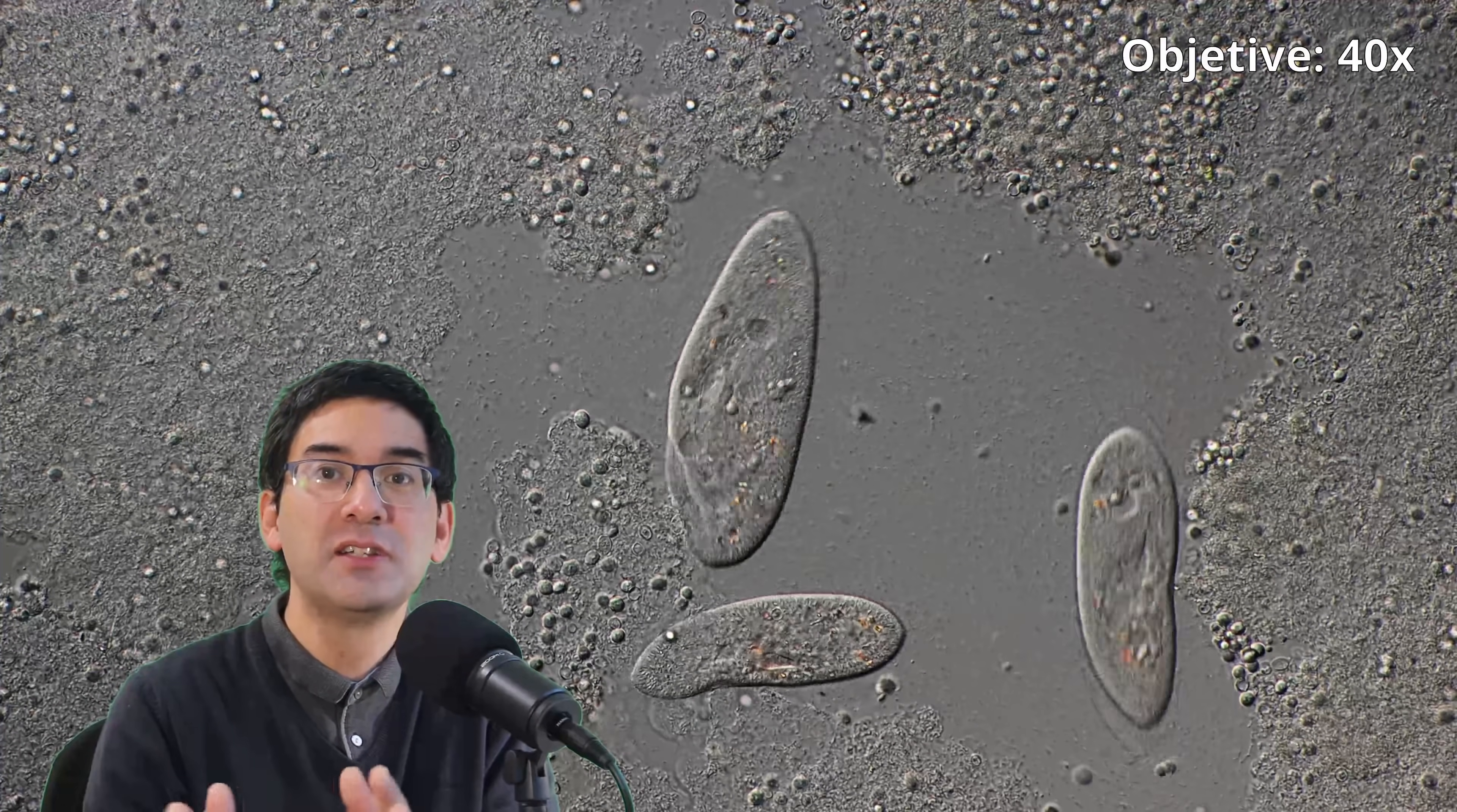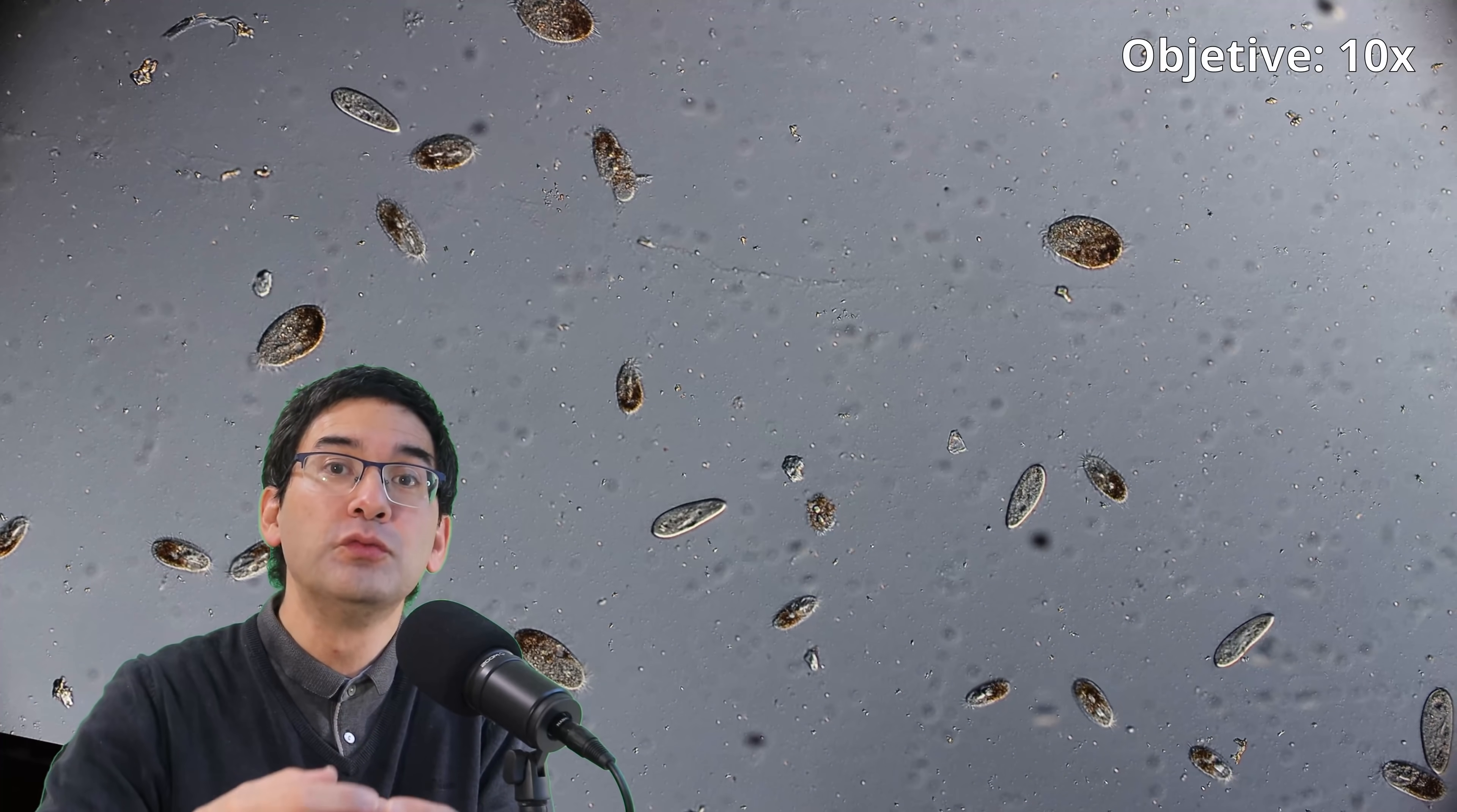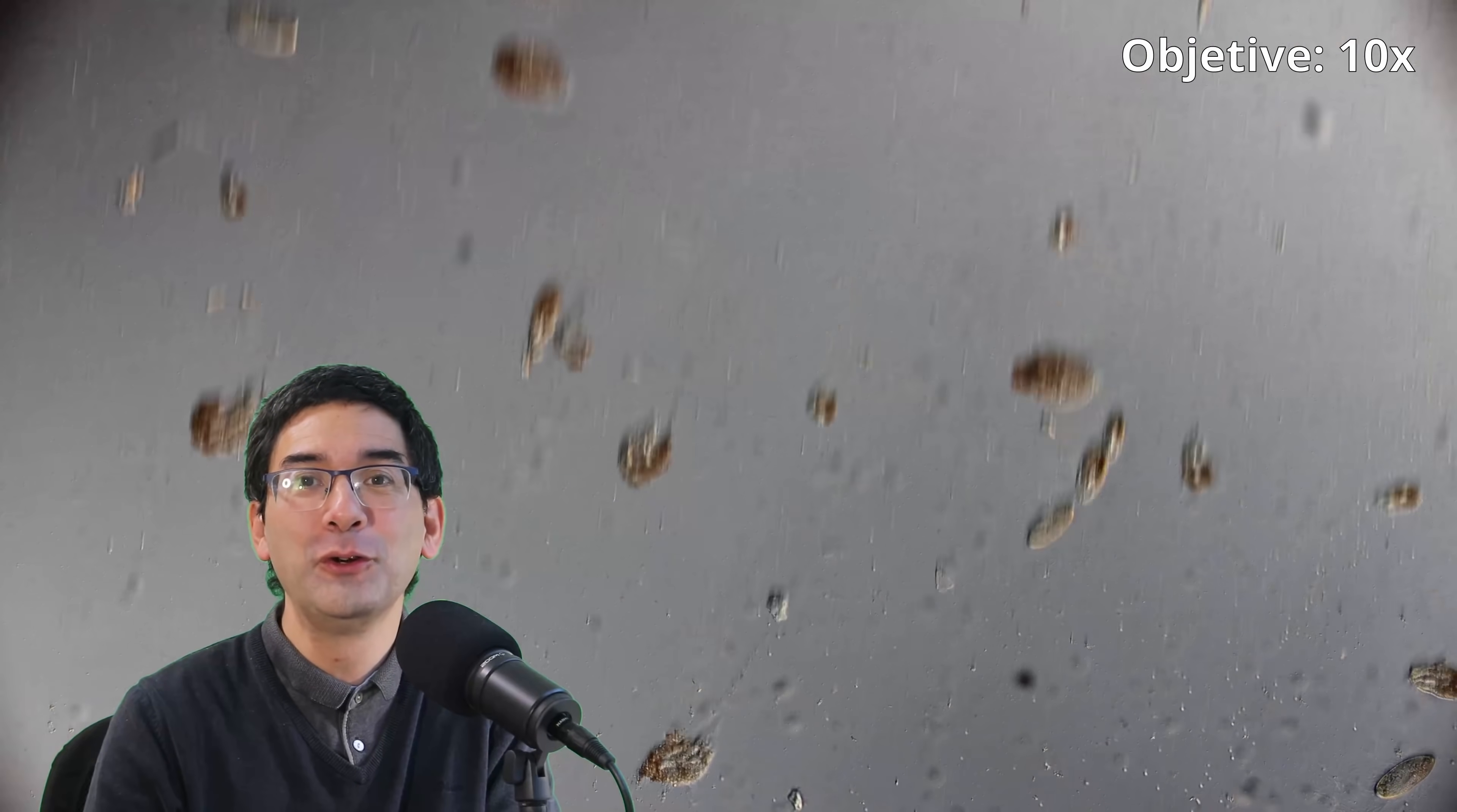Those ciliates here are still fine. But lysis means that the cell breaks open and the cell's contents are spilled out. This happens because the buffer solution contains a detergent that removes the cell membranes. The buffer solution comes from the bottom and notice how some of those ciliates immediately start to break apart and spill the cell's contents. I have been repeating this over and over again.